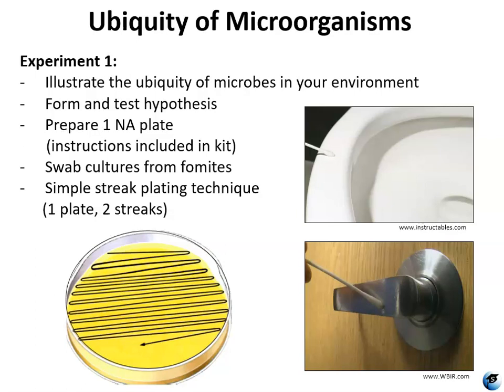So you have your prepared nutrient agar plate ready to go, and just like last time, on the bottom you're going to divide. So this is the agar surface.